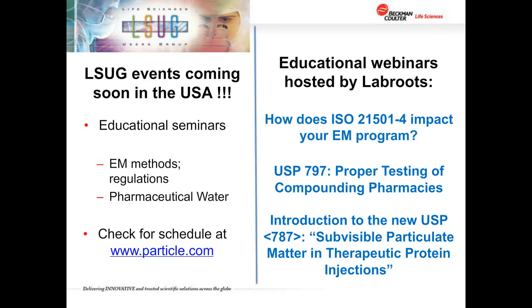Great. Next we have a question from UAP, who asks whether the number of sampling points should remain the same for classification and monitoring, or can it vary? Oh, definitely can vary. And this is a mistake I think a lot of people tend to make, and maybe even have inherited as an operating procedure from someone else. They say, oh, we had this many points for classification, and therefore we need the same number for monitoring. And generally, that's not at all necessary.